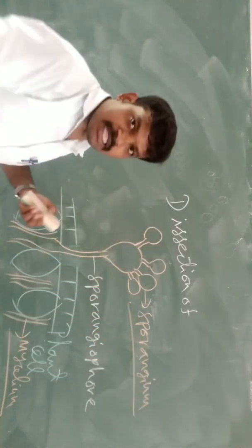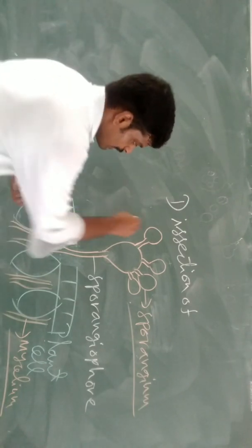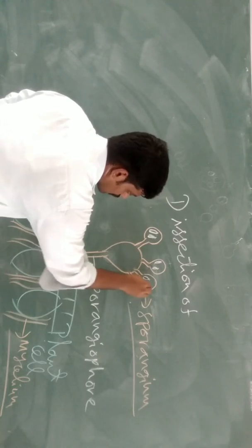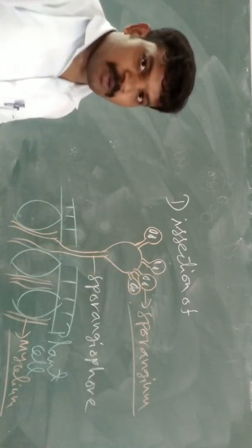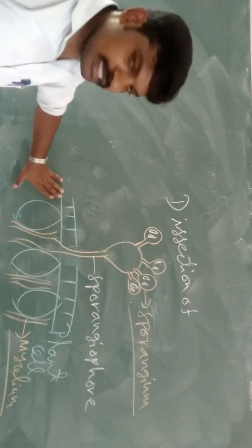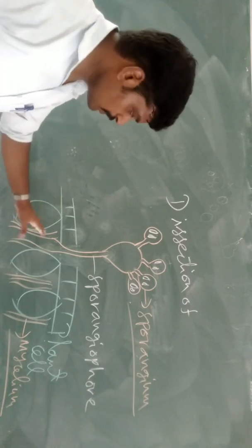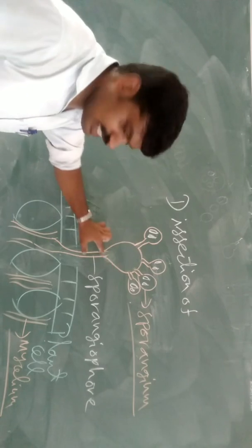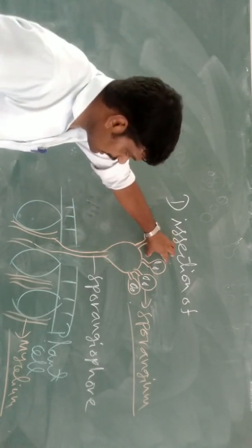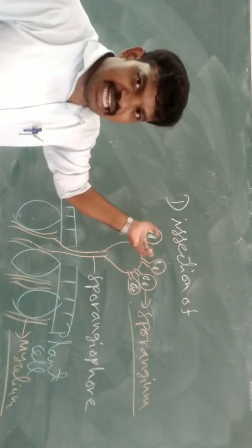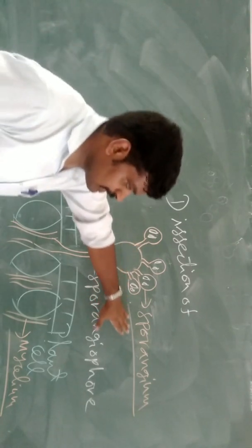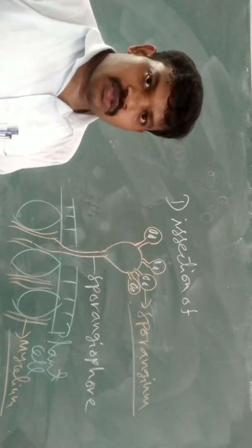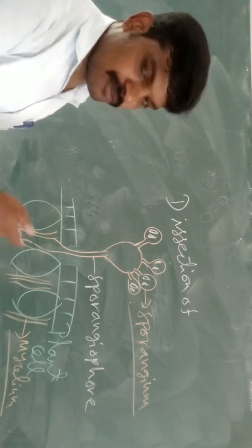Sporangium is a sac-like structure which contains zoospores. This is zoospores. This is the shade of the green color leaf. Next, this is myceliate growth. The mycelial growth will be a swelling structure and the swelling structure will be sac-like structures. The sac-like structure is sporangium which contains zoospores or juice pores. Zoospores of red rust.